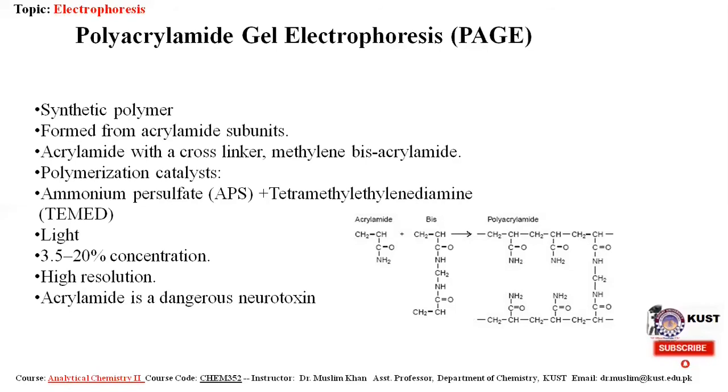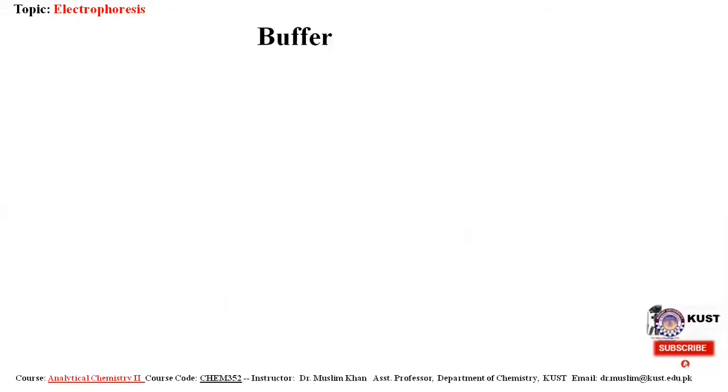One thing you should know is that acrylamide is a dangerous neurotoxin, so you should be careful when using acrylamide while doing your experiment.